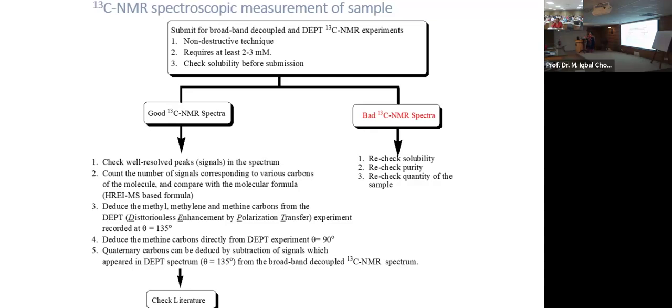But the J value is very, very high. For example, you have one peak here, and then after a few ppm there is another peak, and in between there is a peak of some other carbon, and then a peak of another. It is so crowded that it is very difficult to identify the coupling partners.